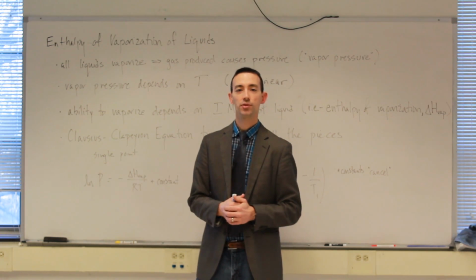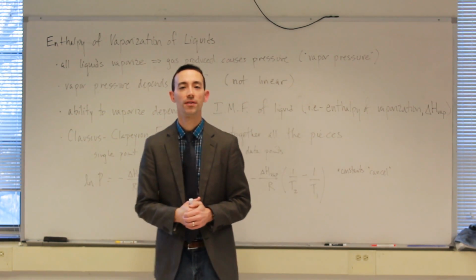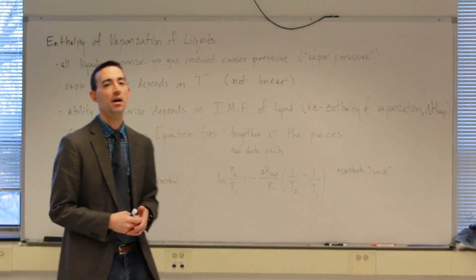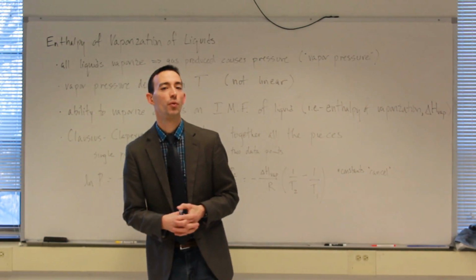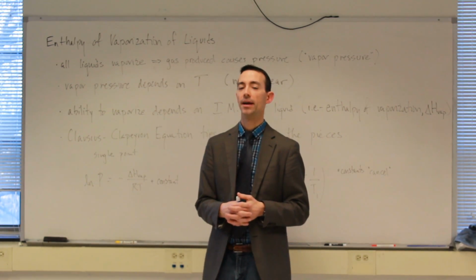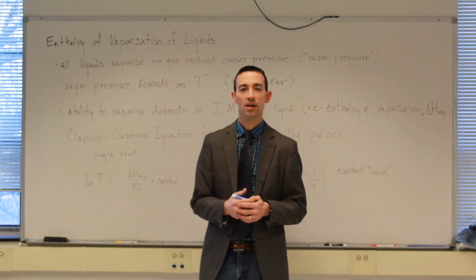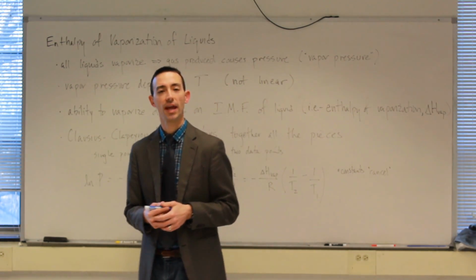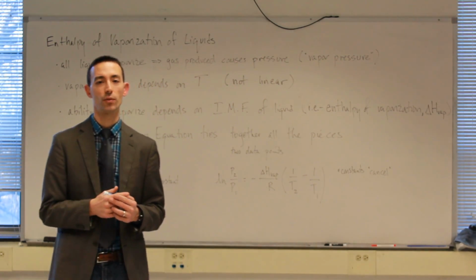Today in the General Chemistry 2 curriculum, we're talking about the enthalpy of vaporization of liquids exercise. It's not really an experiment that we're doing this week. Rather, we're doing a computational analysis to help us determine the enthalpy of vaporization and boiling points of liquids.